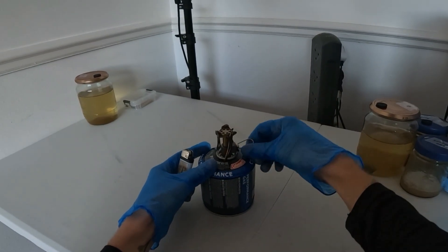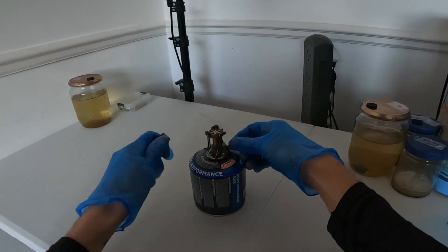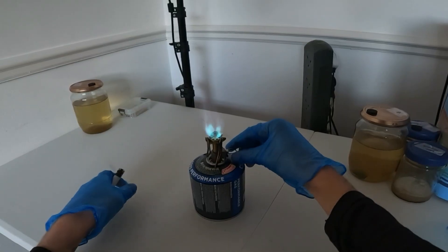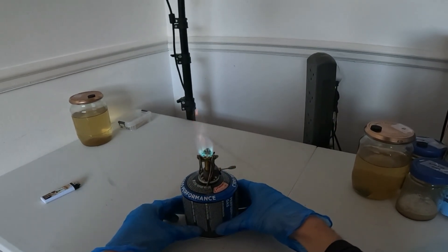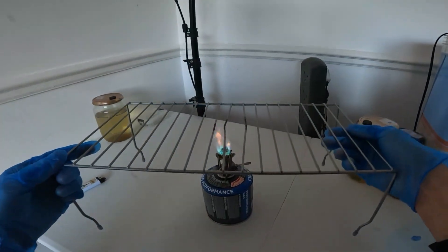Now I wasn't planning on making this video but a lot of you have actually asked how I use this burner to prevent contamination when I'm working, so I just thought I'd make a really quick video explaining how I get this burner to work for me.